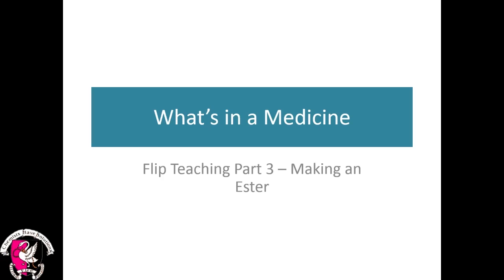This lesson will be the second part of your practical in class, because you'll be continuing with the test that you were doing with the phenols and carboxylic acids, and you'll actually be looking at making an ester as well, briefly. Later in this course we are going to look at esters again, so we will go over them in a bit more detail. This is just an introduction, so that you've got a taste for it and understand what an ester is, so it doesn't just come out of nowhere when we look at it in more detail.